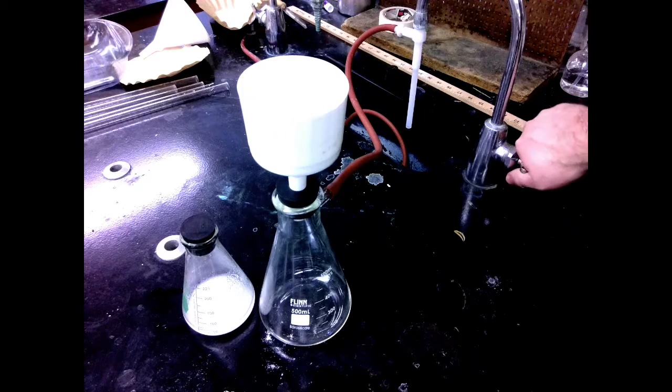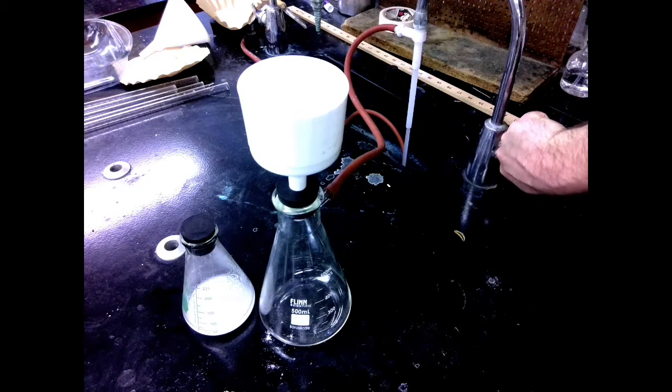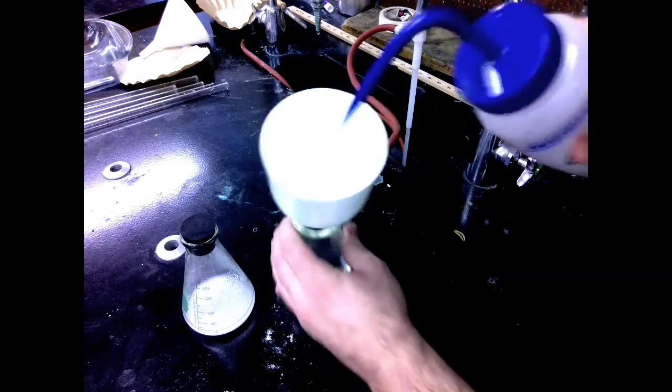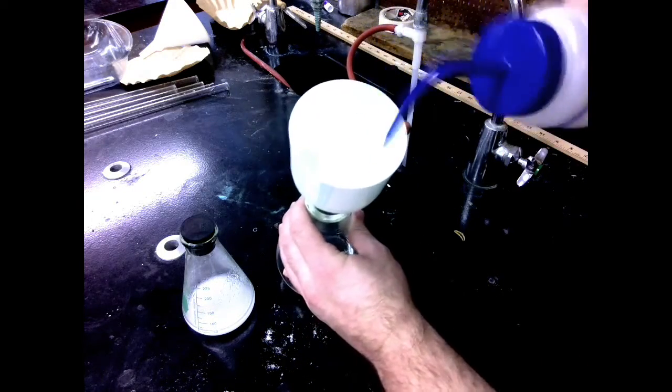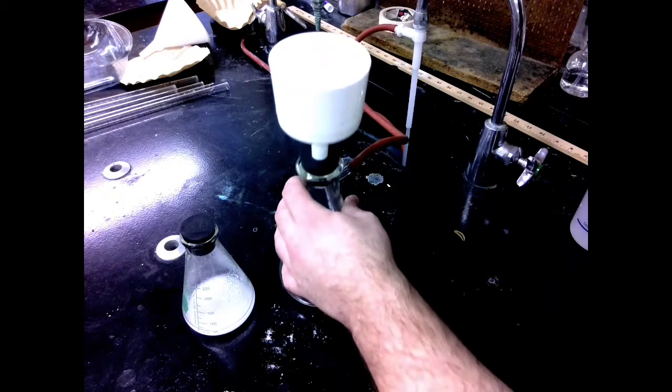So first I turn on my water. I want to get a pretty good stream going. Then I'm just going to spray this with a spray bottle. So it should pull it all down.